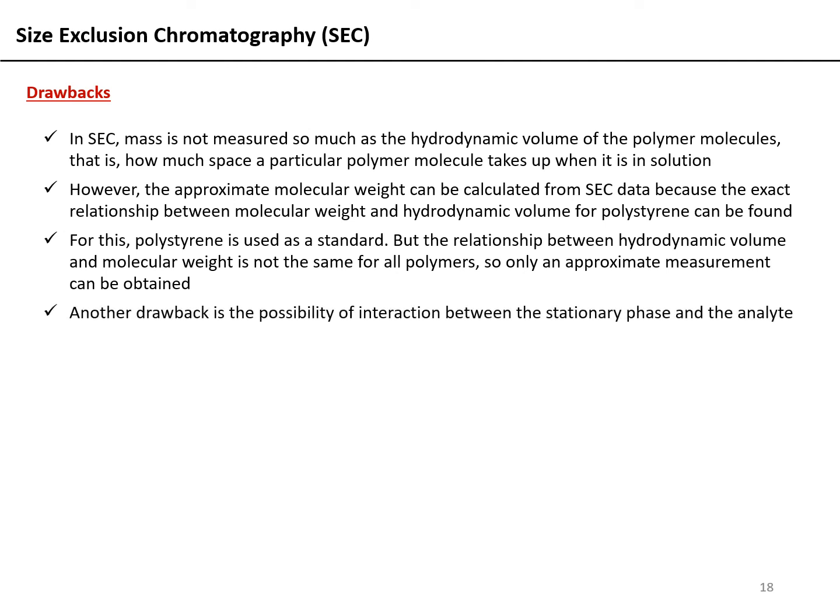Another drawback is the possibility of interaction between the stationary phase and the analyte, but that rarely happens. However, just because it rarely happens does not mean that it cannot happen. I myself have been through an instance whereby there was some interaction between my protein of interest and the stationary phase. Once I injected my sample onto the column, I did not get any elution.